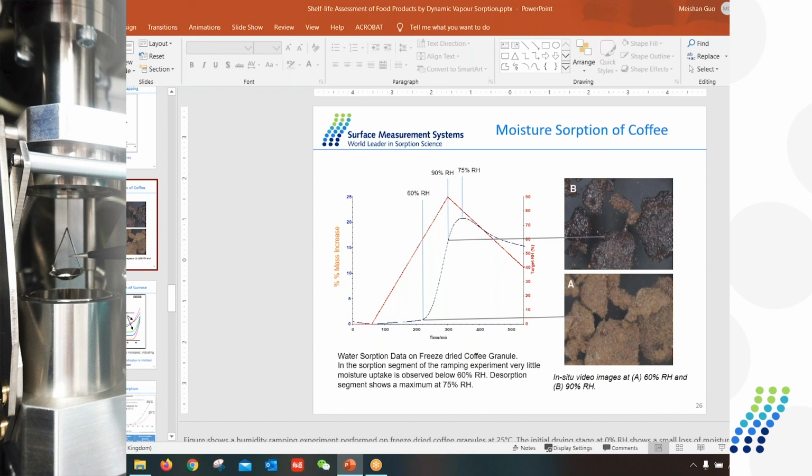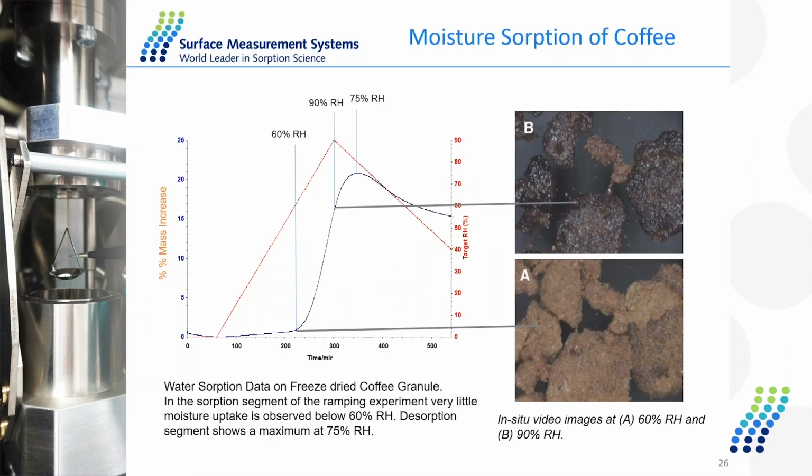With regards to that graph, you are using freeze-dried coffee, and I'm not sure if I heard you correctly, there is a deliquescence there, between 75 and 90% RH. Can you expand the slide? It's a little bit small. You see deliquescence of the coffee.